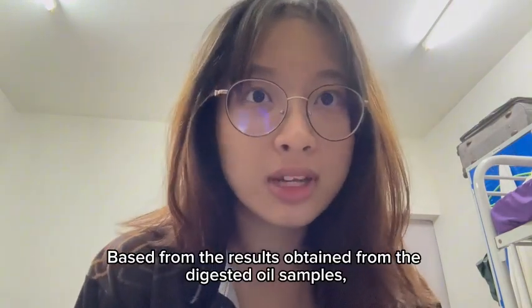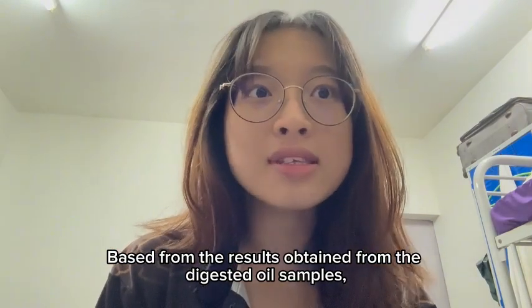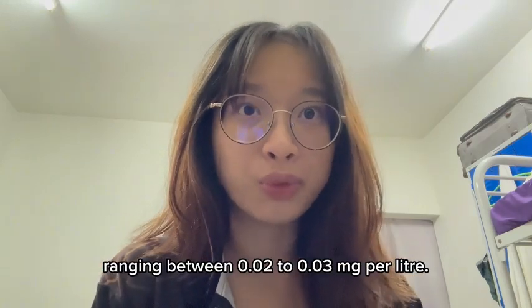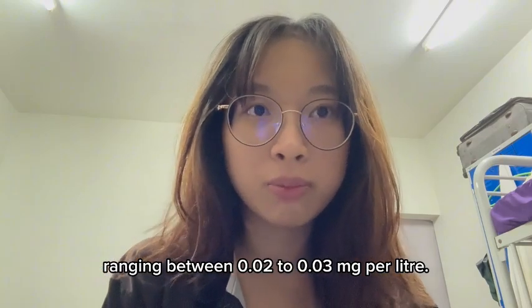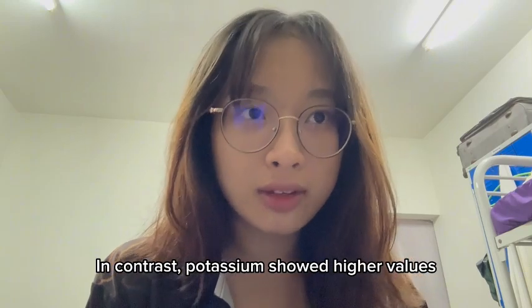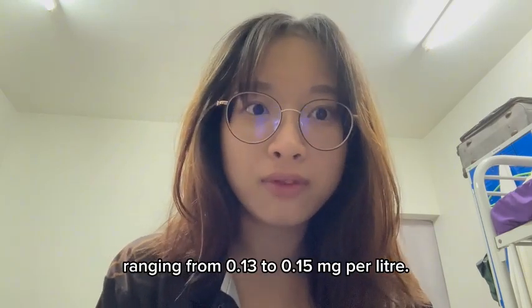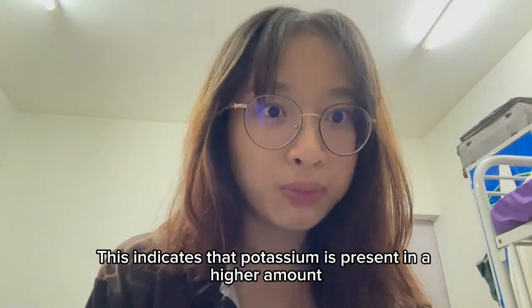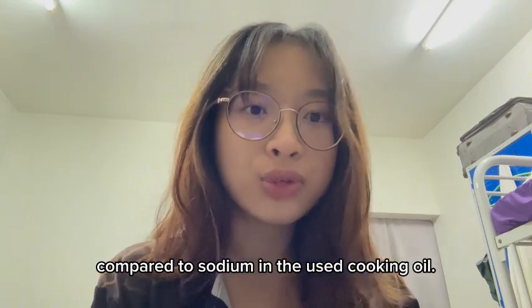Based on the results obtained from the digested oil samples, the concentration of sodium was relatively low, ranging between 0.02 to 0.03 mg per liter. In contrast, potassium showed higher values, ranging from 0.13 to 0.15 mg per liter. This indicates that potassium is present in a higher amount compared to sodium in the used cooking oil.